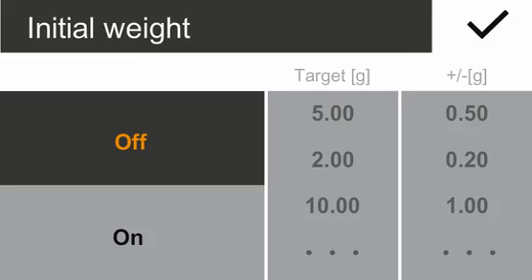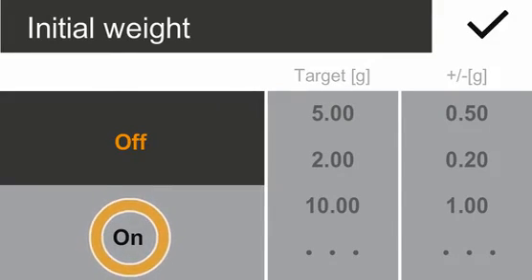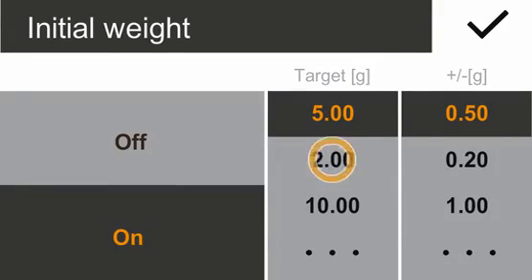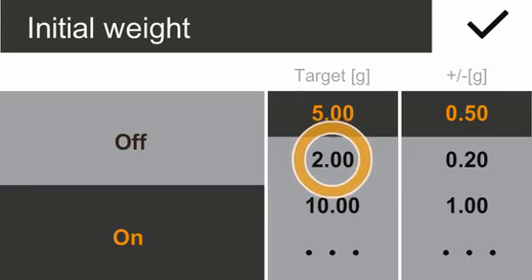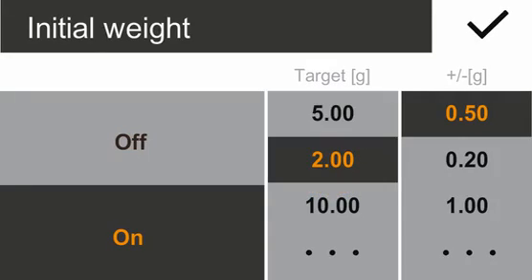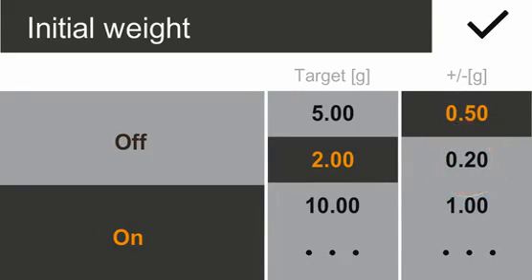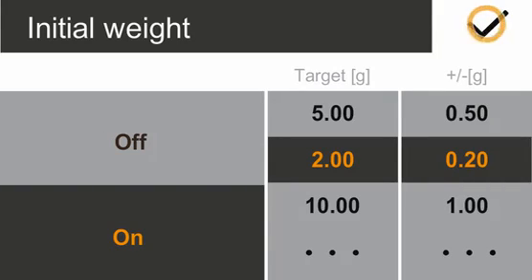Please tap On. Select 2 grams as the target weight and 0.2 grams as tolerance. Confirm your selection by tapping on the hook button.